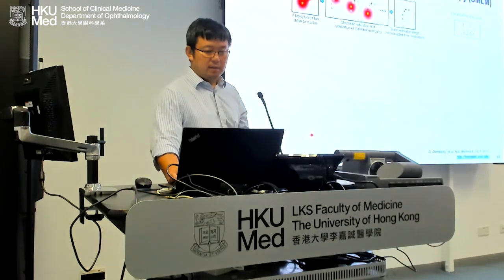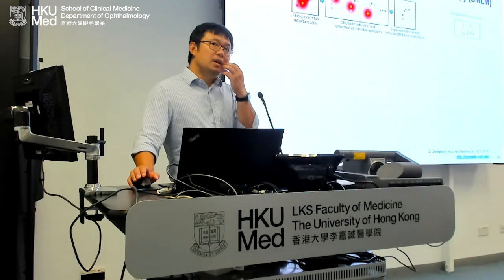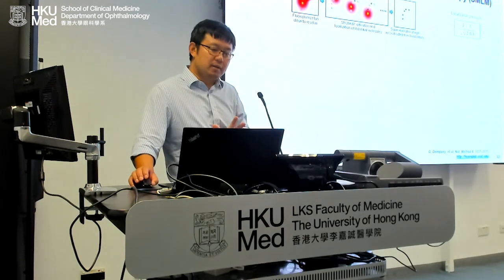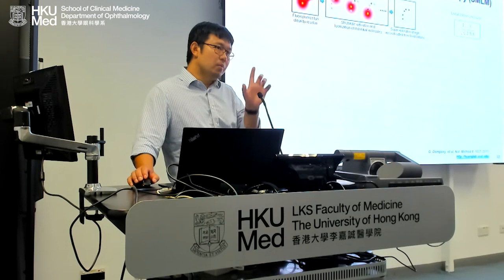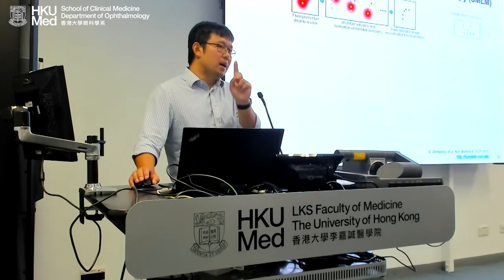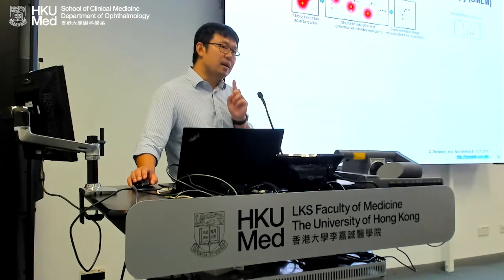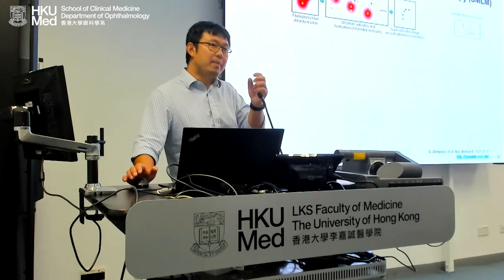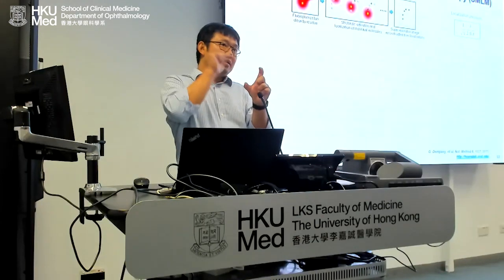How do we overcome that? Here's the principle of localization microscopy. There are 5 molecules that are very close to each other. Optical microscopy can potentially tell there are molecules there, but how many and what they are, that's impossible. If there is a photochemical manipulation so that these 5 molecules won't emit fluorescence at the same time, only one emits at a time, let's say this one emits at a time. If we know statistically there's only one molecule emitting light, we can bypass the size of the spot. We can locate the center. And we repeat the process. So there will be multiple localizations. That's why it's called localization microscopy.